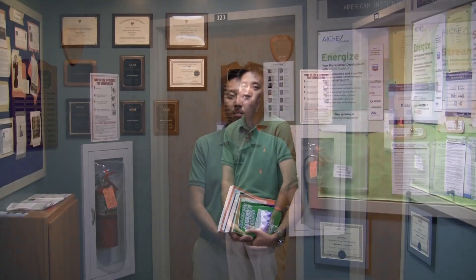Hello again. This is Katsuyuki Wakubayashi in the Department of Chemical Engineering at Bucknell University. Many of you are familiar with our video from a couple of years ago on the solid-state shear pulverization facility on our campus. This new video tour serves as a sequel to the first SSSP video. This time, we'll show you our newest invention called the solid-state melt extrusion that we have recently developed in our laboratory.